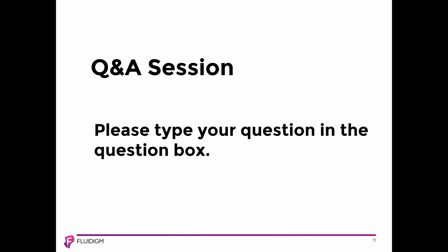Great. Okay, so the next question is a mass cytometry question. How easy is custom conjugation of antibodies and what's the chemistry? So I'll take this one.